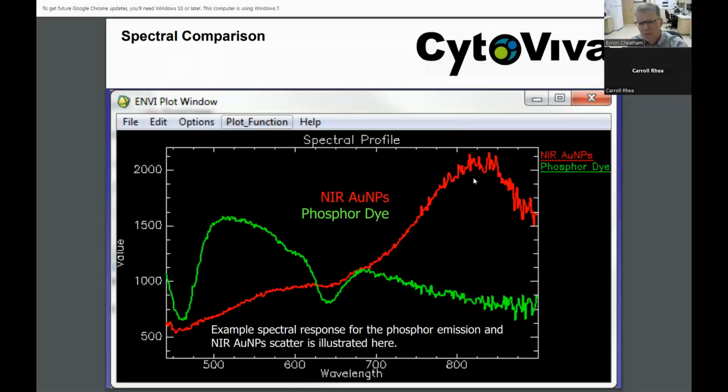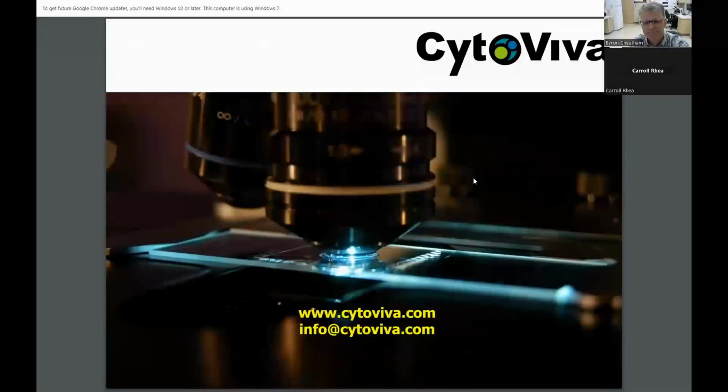Okay, so this is an application where hyperspectral imaging can give you the spectrum of photoluminescence emission and surface plasmon scattering in the same image, and record that at the same time in a single pass. And it speaks to the power of optical spectral imaging and its ability to do that, which is quite unique and can have lots of applications and utility.